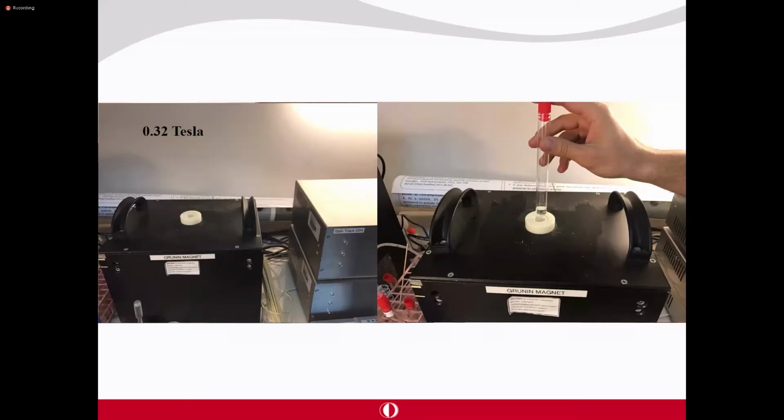And here you see another NMR system. This is a system that has been built by Resonance Systems, and in fact, this also has gradients in it, which means it is capable of doing imaging, but we still don't have the desired software.